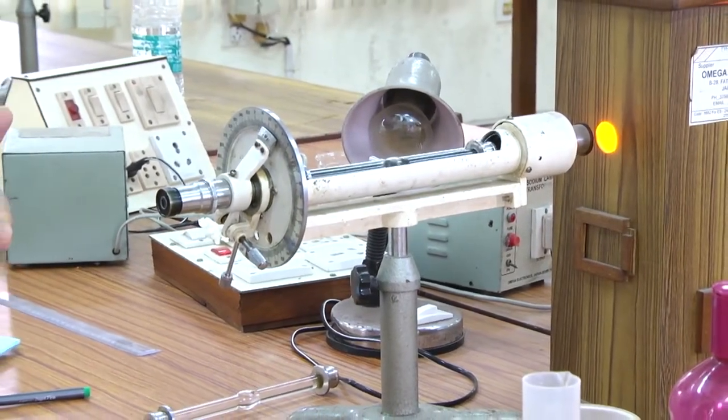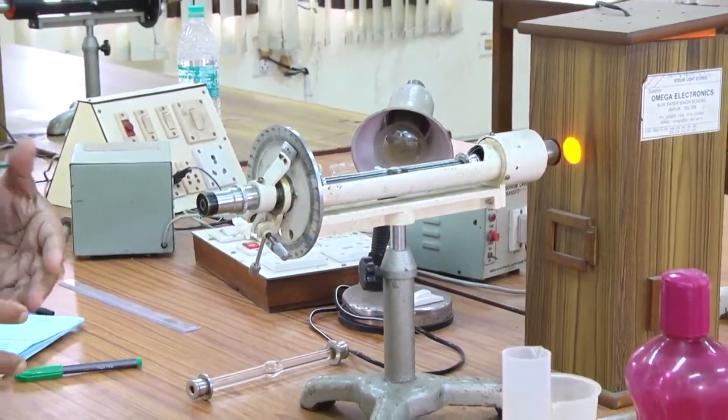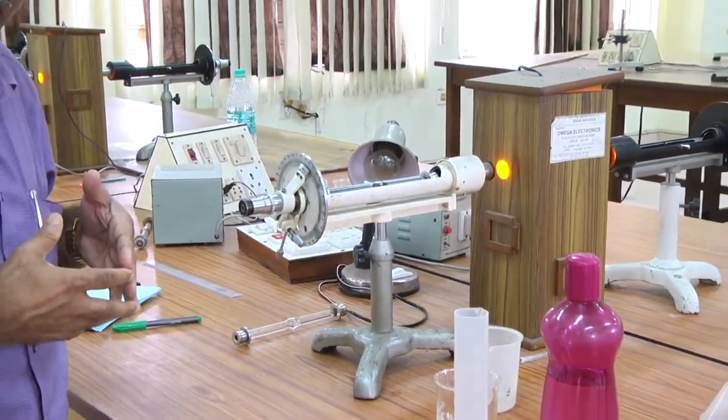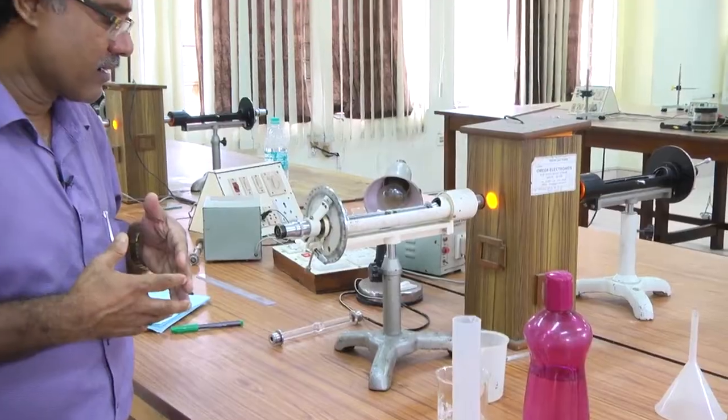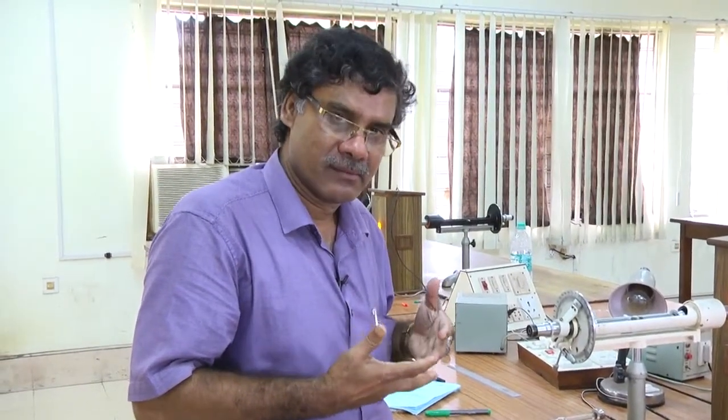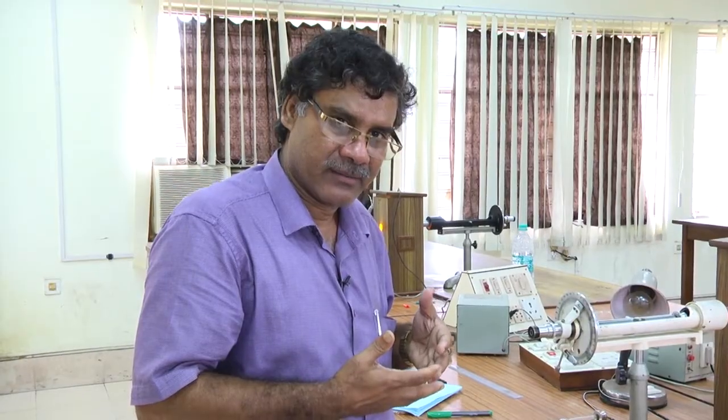Only in this experiment, the main part I discussed and demonstrated is what the function of a Laurent half shade is, and how we can explain the uniform illumination, or half uniformly illuminated and half dark.